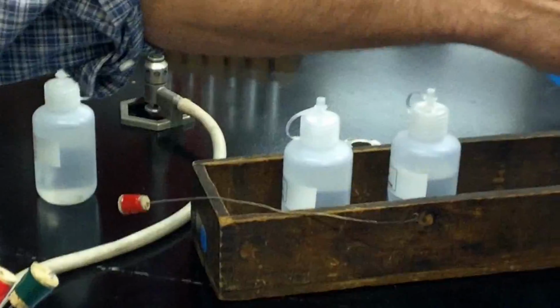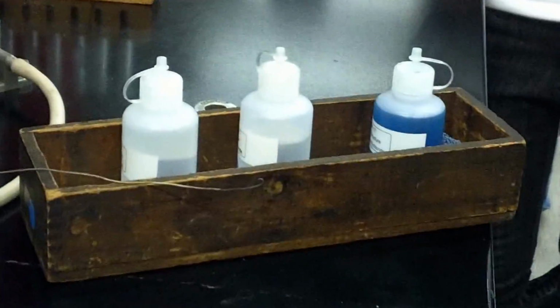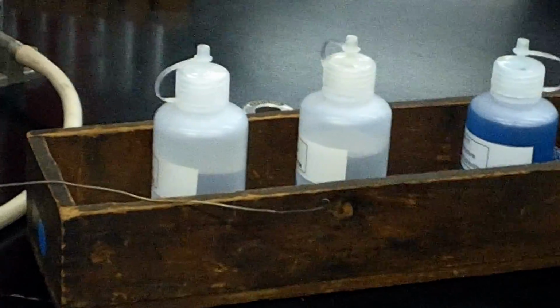So this would be sodium chloride. This is calcium chloride, potassium chloride, barium chloride, and copper chloride. So each one is a chloride. Chloride is the second name, but they're all different cations. So we'll take a little bit of each of these.